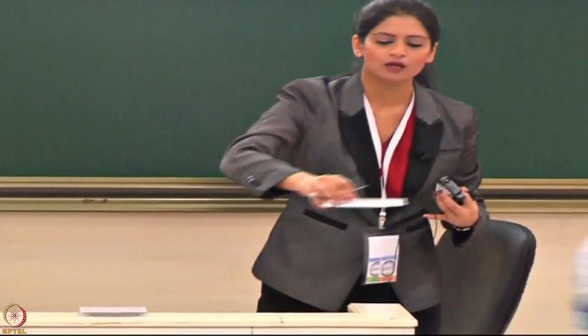So imagine doing one entire ELISA in one well and doing 96 ELISAs in one plate at one time and doing 100 such plates. So 96, my maths is very bad, that's why I'm a biologic person, but if you calculate this yourself, you will be able to understand how many ELISAs you can do and how much time you can save to actually analyze the data points to get your data right, because it's going to be highly accurate. So I'll show you, this is the plate that I'm circulating across.